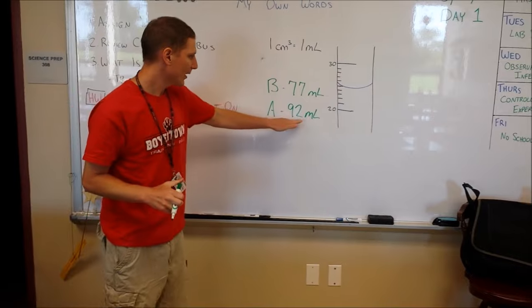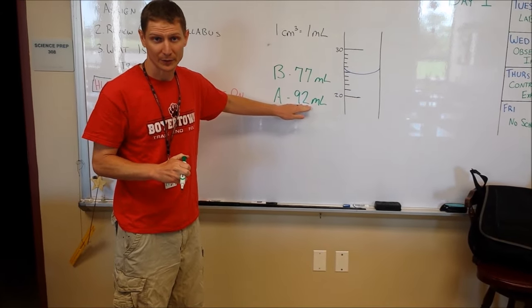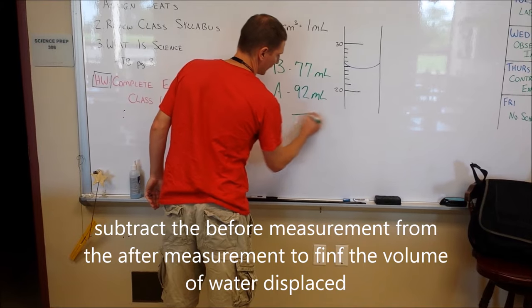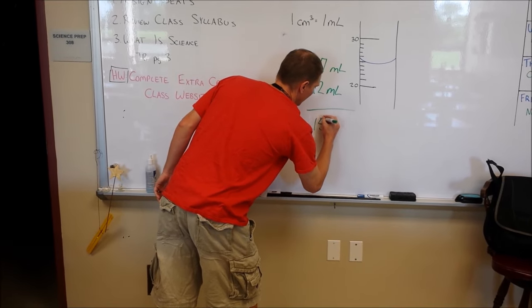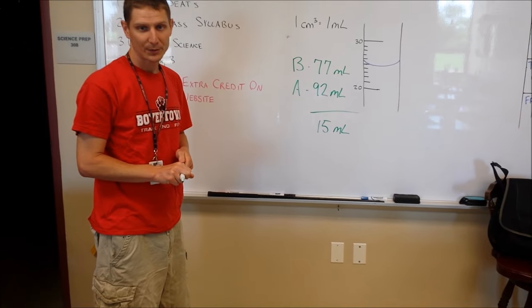Now our object does not have a volume of 92 milliliters. What we have to do is subtract these two in order to find our actual volume. So we have to find the difference of them. So the volume of the displacement is 15 milliliters.